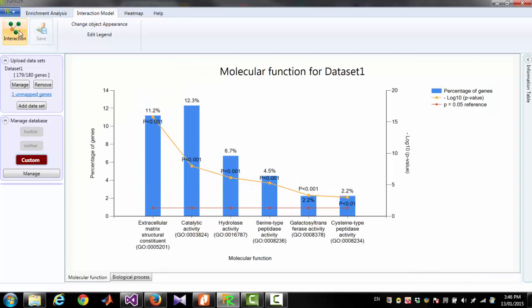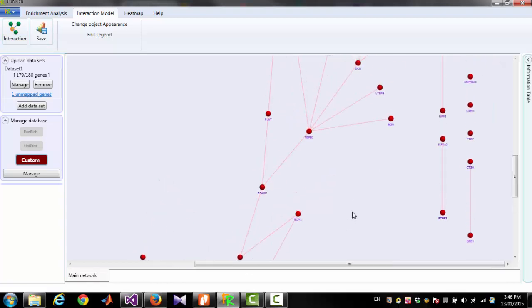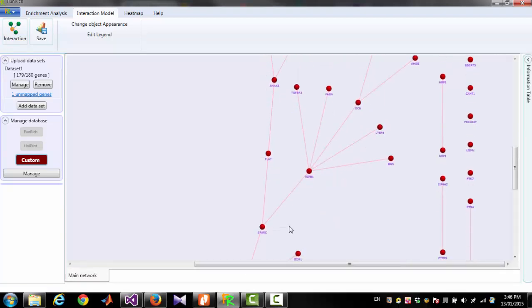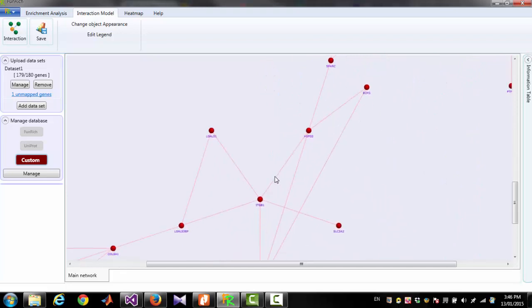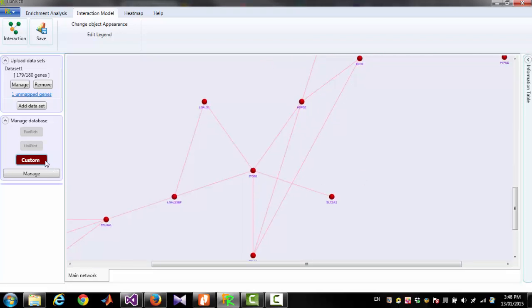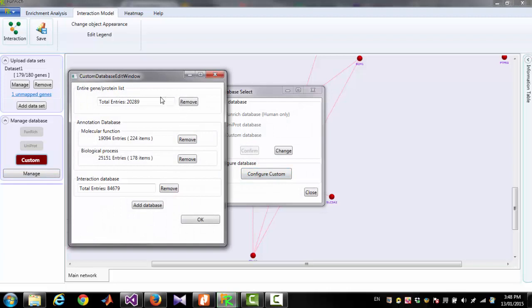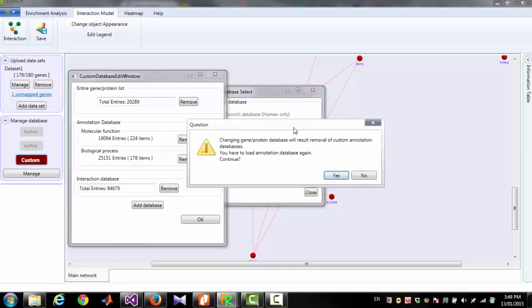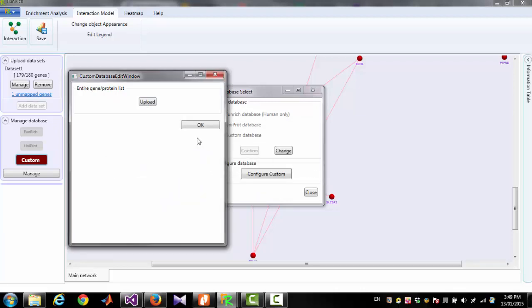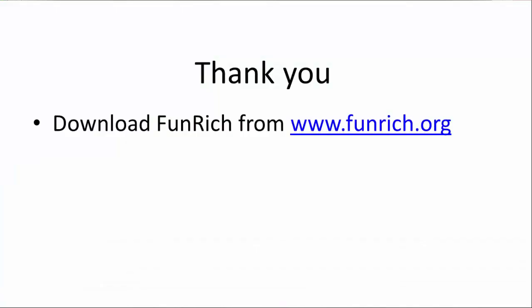Now you can click on the 'Interaction' button and get the interaction diagram. If you want to make any change in your custom database, go to 'Manage,' then 'Configure Custom.' You can remove either molecular function, biological process, or the interaction database. If you remove the entire gene or protein list, then all other databases will also be removed and your custom database will be completely clear, and you can upload it again. That's all for today's session. Thank you for listening. Have a nice day.